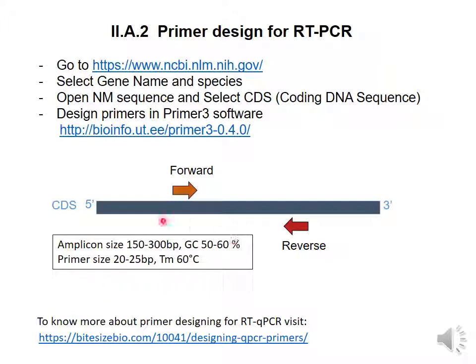These are general conditions that are necessary to design primers with good quality for qPCR. And if you want to know more about how you can design primers for RT-PCR, then you can visit this website that provides all the details necessary on how you can design primers for RT-PCR.